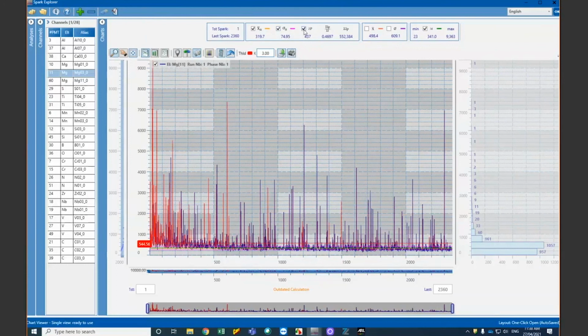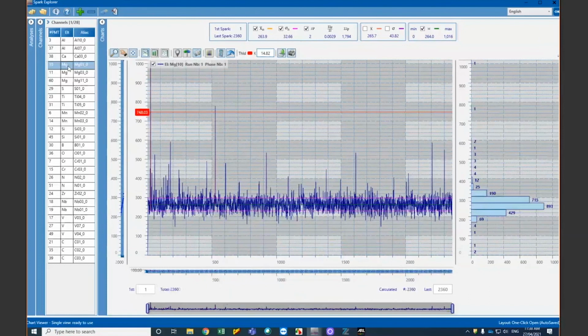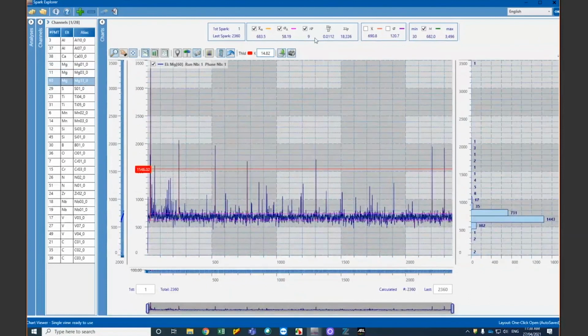And then you have the possibility to calculate the number of the peaks according to the defined threshold here, and calculate the insoluble ratio for this element. So for different elements, you will see all this calculation is the same calculation as we did for inclusion analysis.